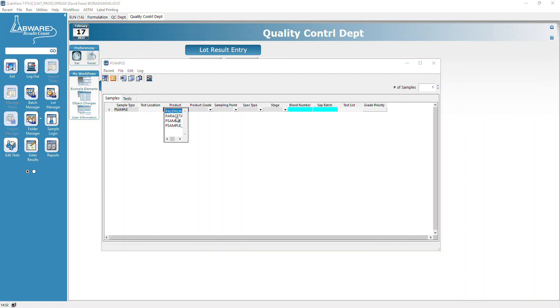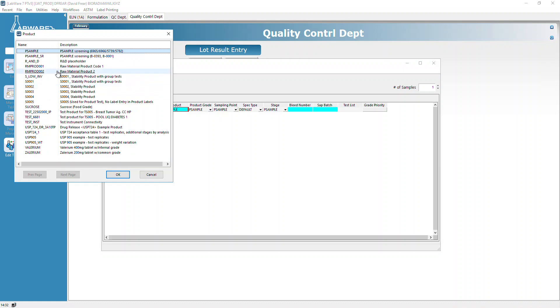This is going to be P sample, so if you type P and hit enter, you'll get these choices. We're going to select the first one that says P sample.